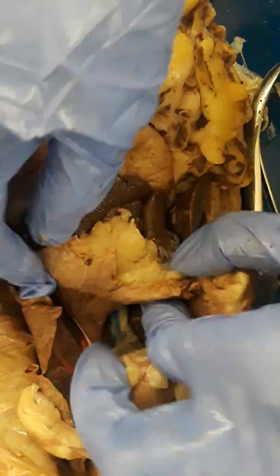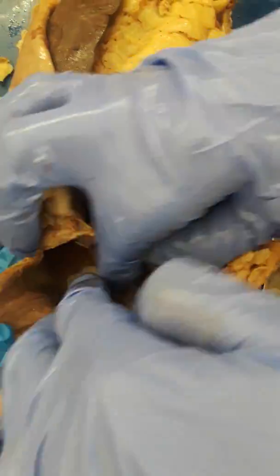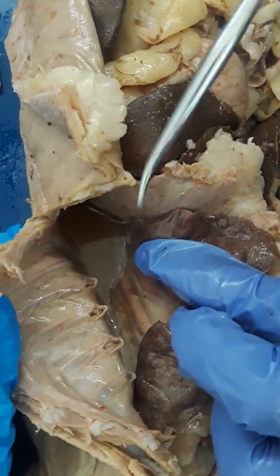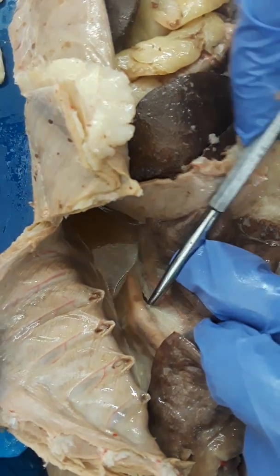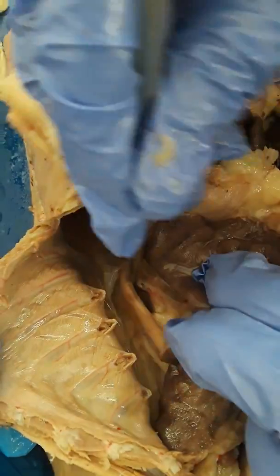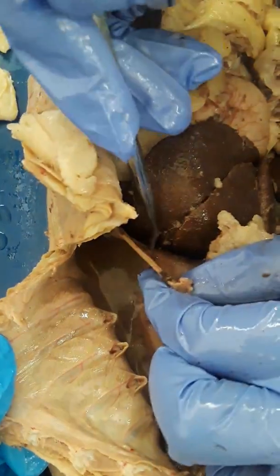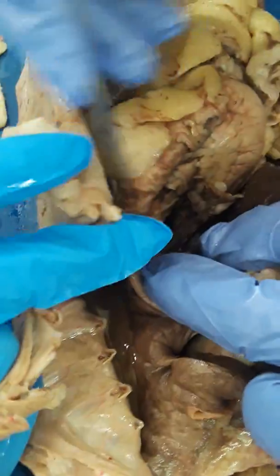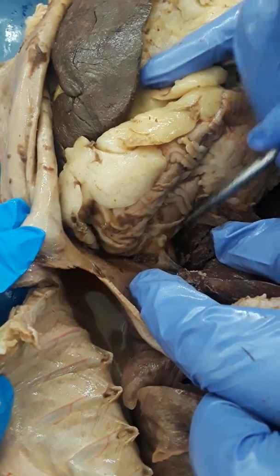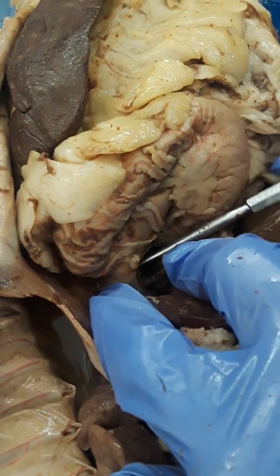Right below the heart, we have the diaphragm. Move the lungs out of the way. It's full of fluid now. Exactly, it's full of fluid, but you can also see the esophagus, which is here. So the esophagus is going to run all the way down, and then it's going to go through an opening within the diaphragm and then connect to the stomach, which is here. So this part here is the esophagus.